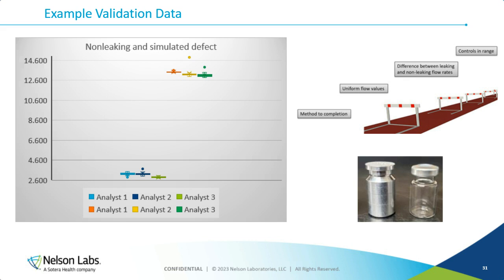We do see that sometimes the master, because again, it's a 0 leaker, will be lower. And we're going to be in about the same range, though, with the CLO. And so our controls are good with this method.